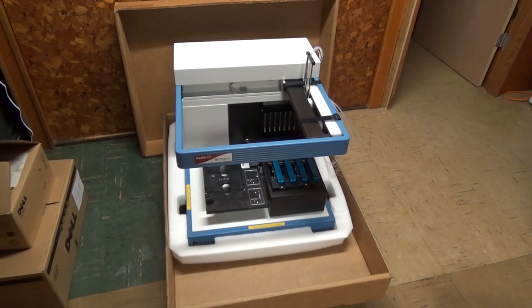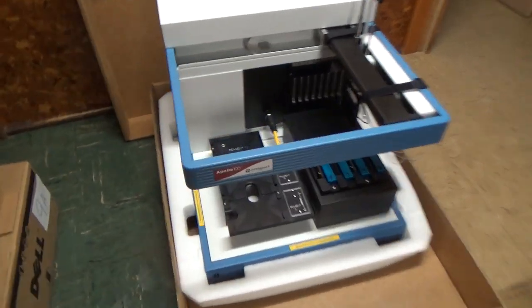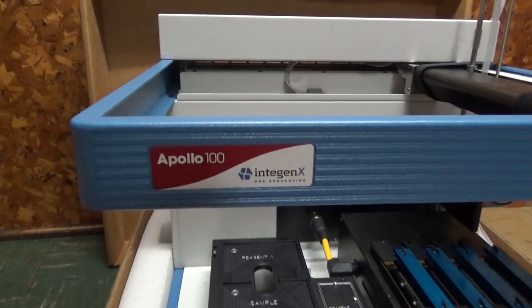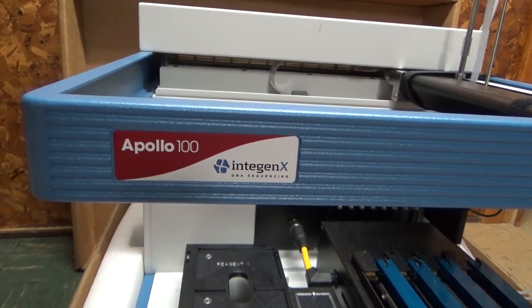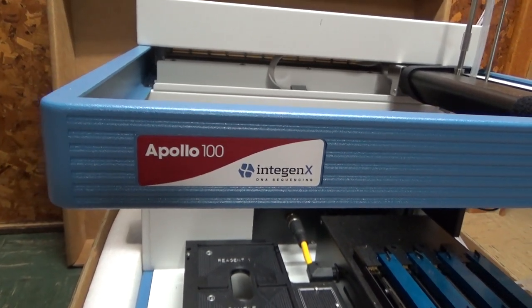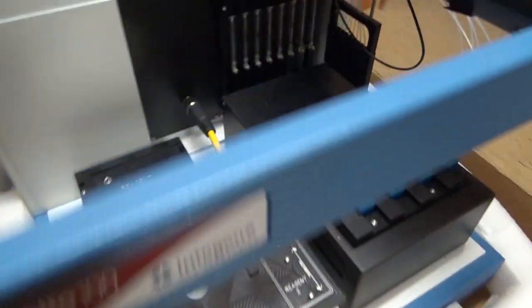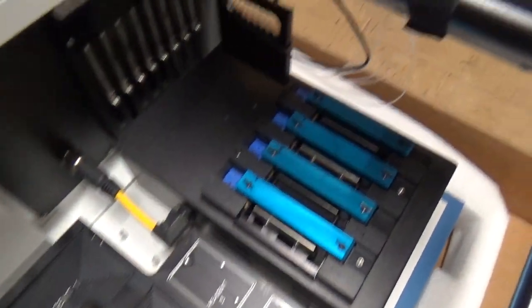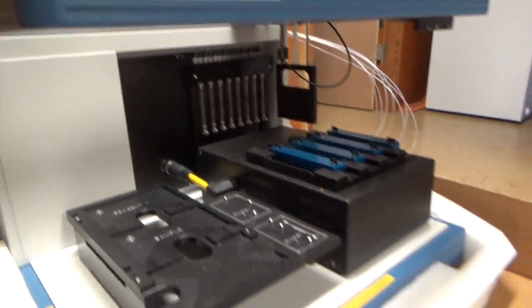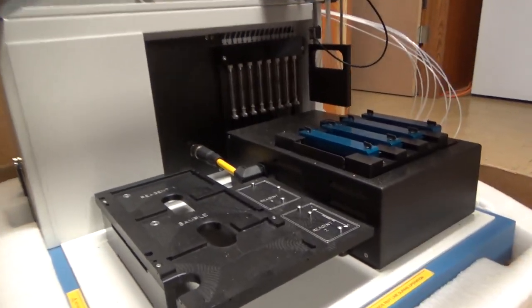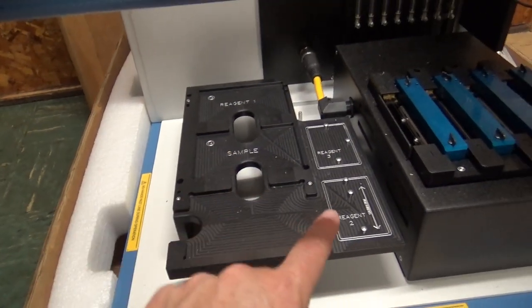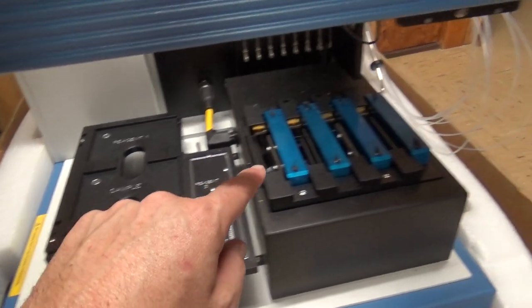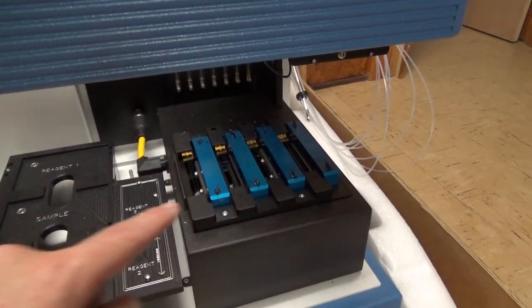Okay, so this appears to be our DNA sequencing lab in a box. So this is an Apollo 100 by Intigen X. Not sure if they're around anymore. I think they've been bought out by somebody else. And we've got our test bed or operations bed here. I don't know what any of the components of this are and I really don't know what it does. So I'm going to get all of the terminology completely wrong. But it looks like some of those sample holders or test tube holders go in here. And then those microchip things go in here with the cartridge connectors.